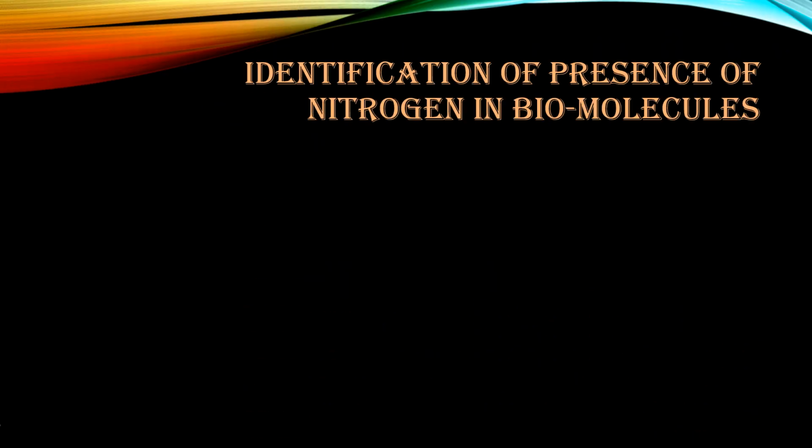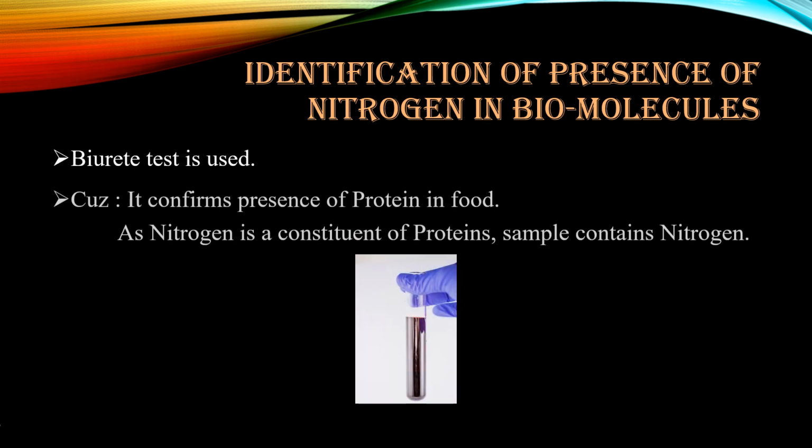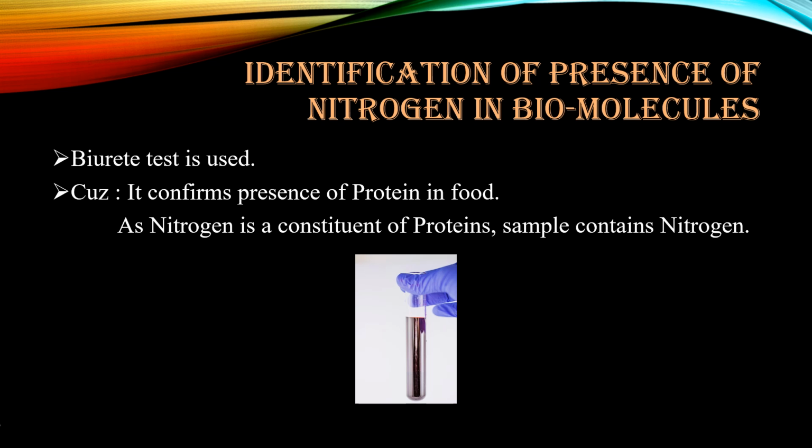Finally, identification of presence of nitrogen in biomolecules. Well, for this, the Biuret test is used because it confirms the presence of proteins in food, and as nitrogen is a constituent of proteins, the sample contains nitrogen.